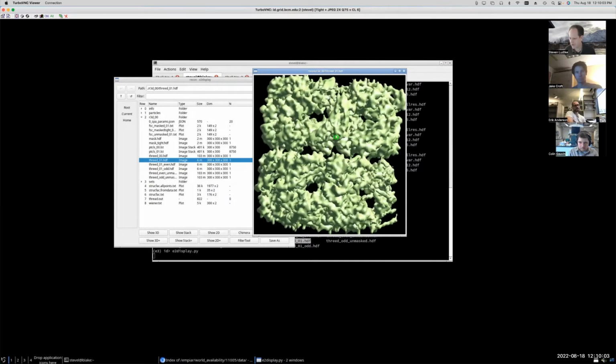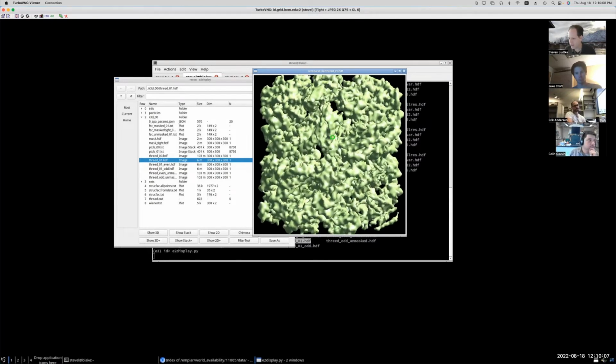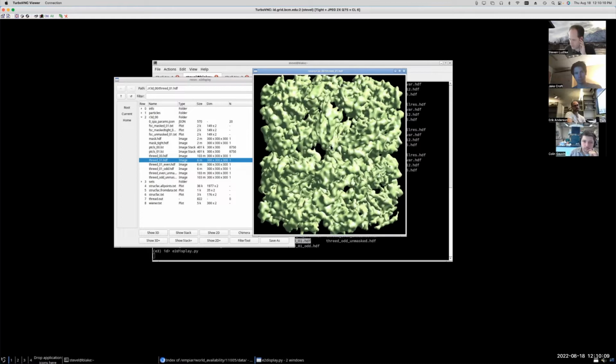So I guess what I'm saying is, if we had tried to run a refinement on it, I can't predict what fraction of them would have gotten aligned with the correct symmetry-related orientation. If we weren't doing this with a highly symmetric molecule, if we were doing it with something like a ribosome and moving a chunk of the ribosome around, there wouldn't have been any issues at all. But when you deal with symmetric particles, which have symmetry-breaking artifacts, then you have to jump through some extra hoops to handle some of those details.